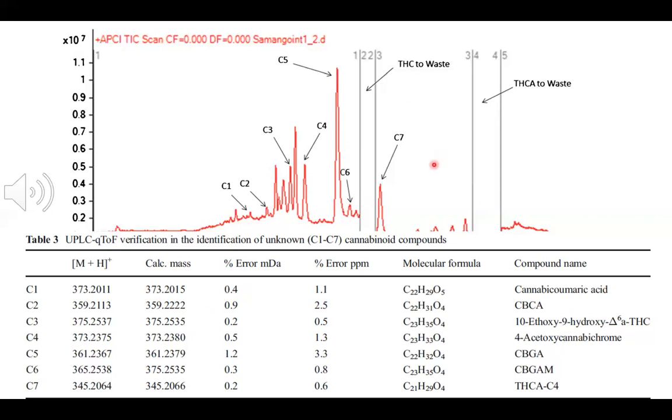And in the previous slides, I showed the trueness and the precision in comparison to other methods. So yeah, I think this was a very interesting study, which showed a way in which we can tackle the separation problem of separating cannabinoids and using HPLC to do it.